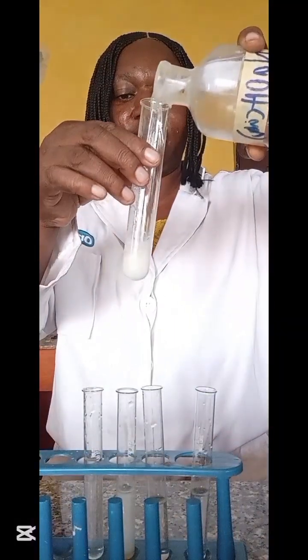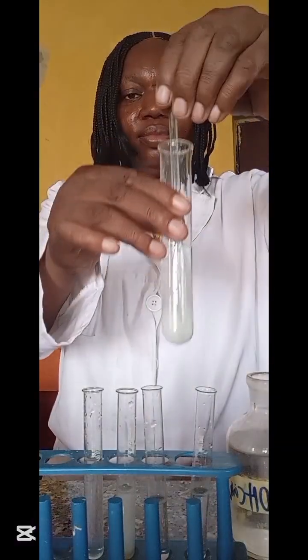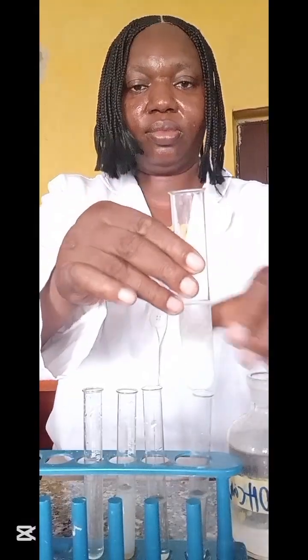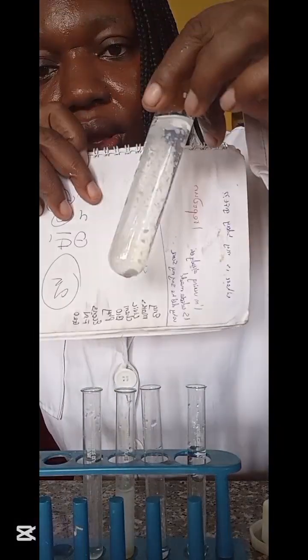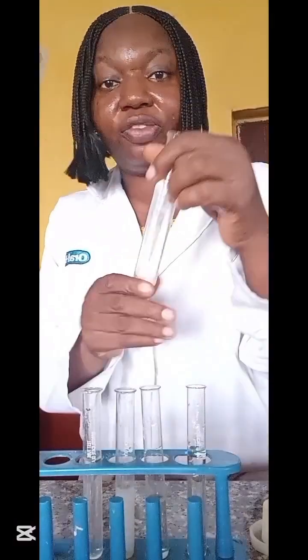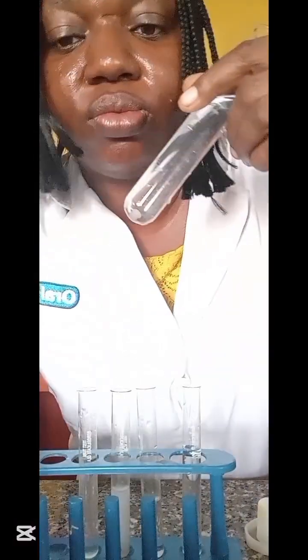Either Zn2+ or Al3+. Now in excess sodium hydroxide, see, it's clearing up. At times it does not go immediately, but if you know what you're doing, you'll be patient with it. And you can see it in solution.